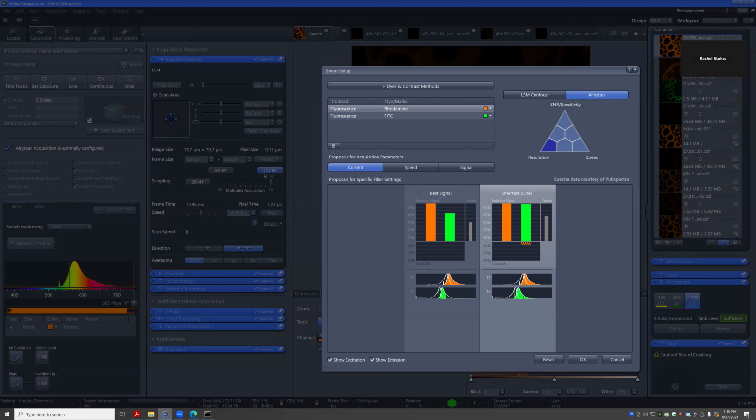It is still using that multiplex mode. This is why I don't like the name multiplex. They used to call it fast, and then they said, we have a new version, we're going to call it multiplex now. And then everyone who does multiplexing of fluorophores asks, is this for multiplexing fluorophores? No, it has nothing to do with it. This is why I like fast. Just call it fast. So really, all these modes are faster modes.